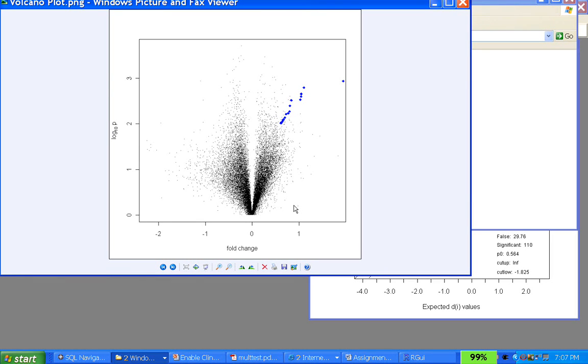So when you think about this homework, you have to get the p values for all of your expressions or all of your cell files. You have to get the fold change for all the features in your cell files. So that's the overall entire set. Then you run the test statistics based on the simple pairwise filter, and you get about 20 or so that meet the criteria of p-value less than 0.05. Those you then plot over here.